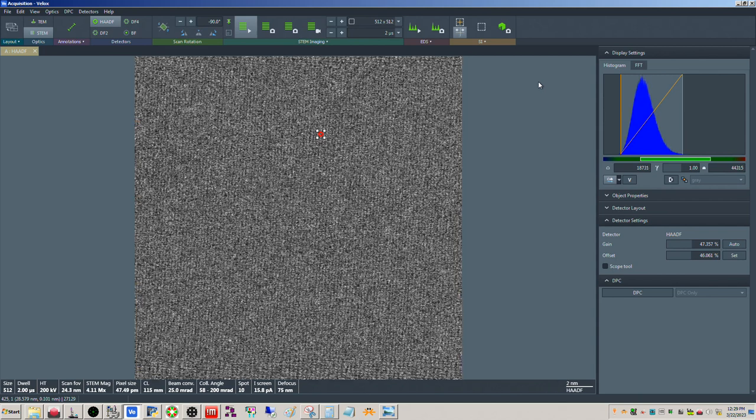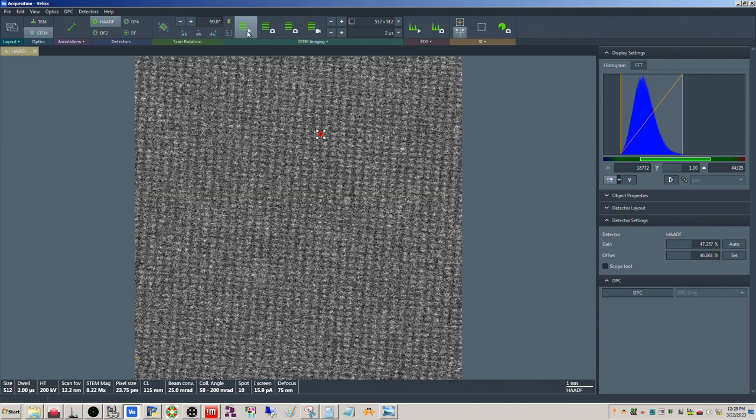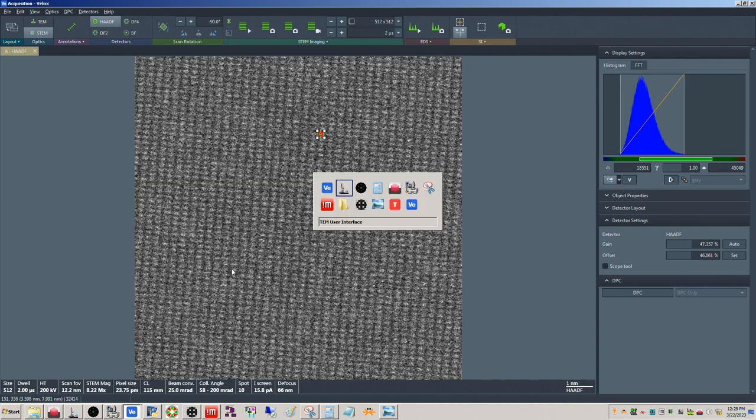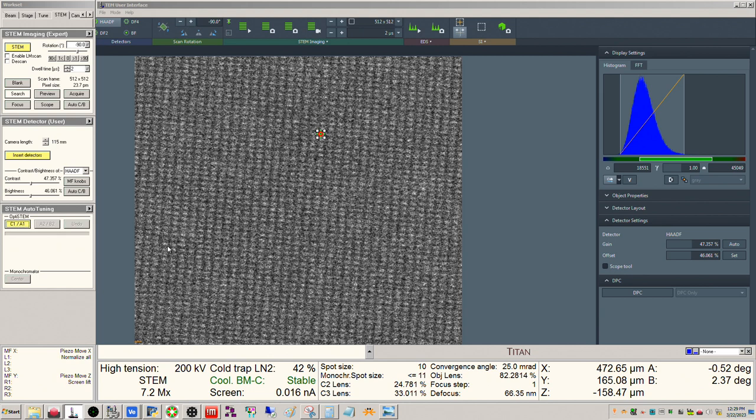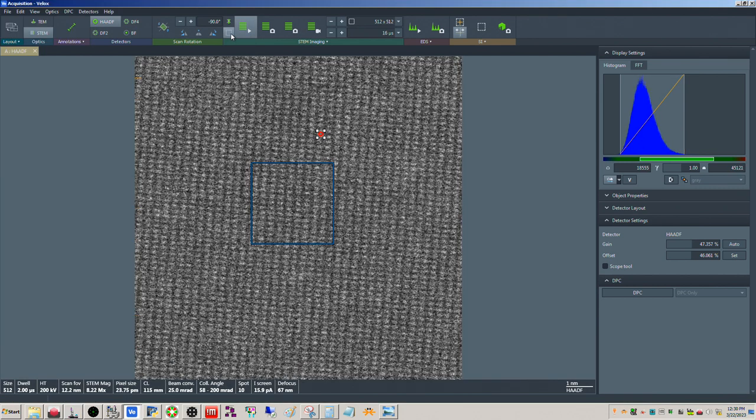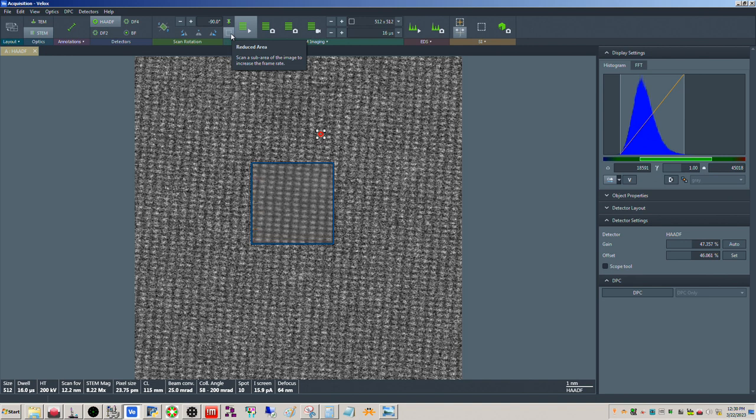All right, we'll see if this gets us any better here. Yeah, I think this is a little more promising. Now we can run C1A1 again, so we'll go ahead and do that. We can just run it from within here. This is really quick, it takes like 10 seconds. We'll see how close this gets us. Okay, yeah, I think we're in better shape here.